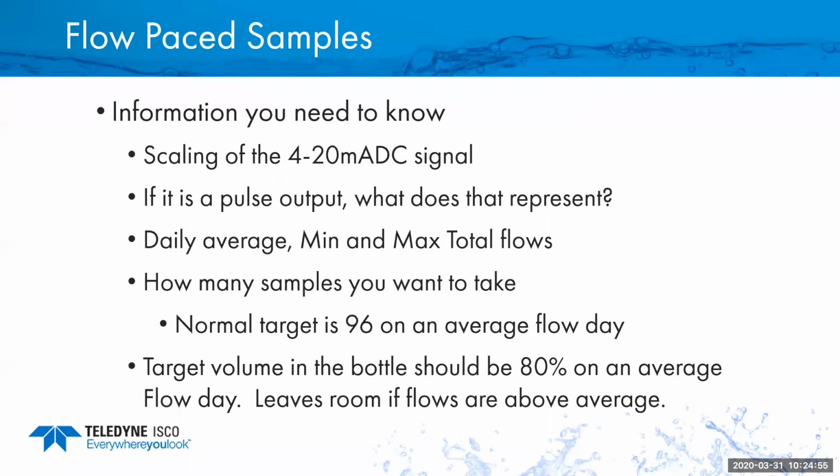So definitely you need to know what the scaling is. On a 4 to 20 milliamp signal, 4 milliamps, if it's outputting, is usually 0 flow, and then 20 milliamps is going to be your max flow on that. So we definitely need to know what that 20 milliamps, or your max flow, is on there.